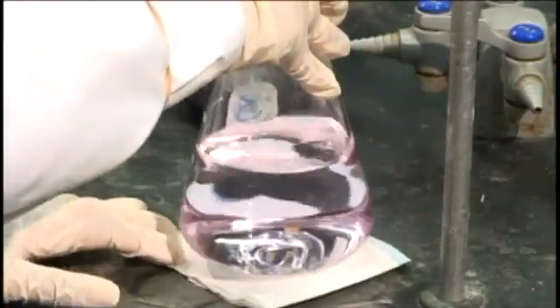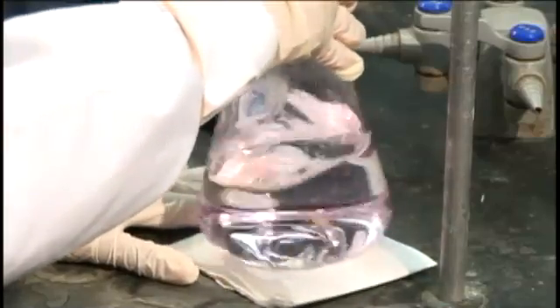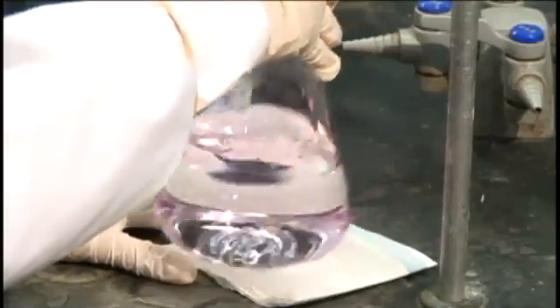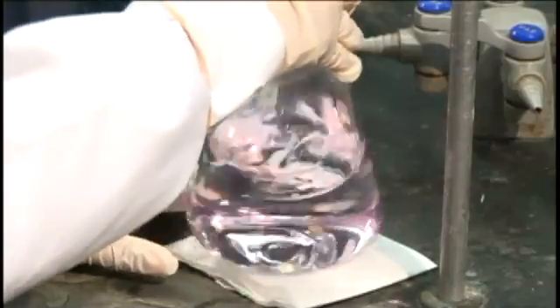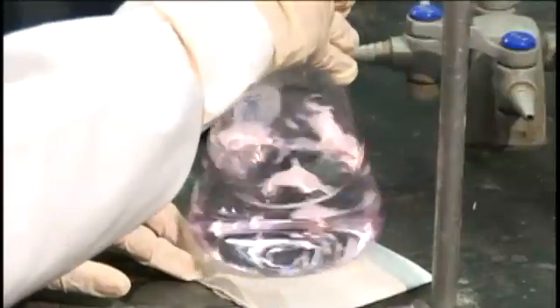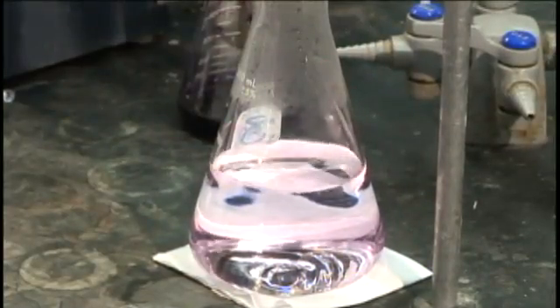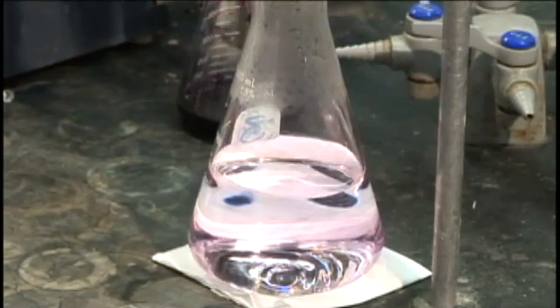So once you get a pink color like this, swirl it for about 30 seconds to make sure the color persists. If the color goes away, add another drop, then swirl for 30 seconds. So once you've reached this color, record your final endpoint.